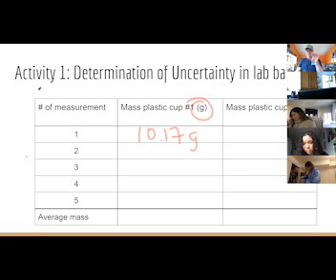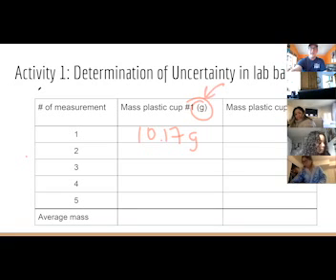I'm going to jump on people for leaving units out of measurements, because a measurement without a unit is just a number, and numbers are useless. Numbers don't mean anything. 10 is a meaningless number. 10 grams, that tells me something. It means it's not 10 ounces, it's not 10 pounds, it's not 10 kilos. So you always, always, always have to have the units in here. So if you have the unit in the top of the table, you don't have to have it here. But if you don't have the unit there, you must include it there. The unit has to be somewhere, okay?